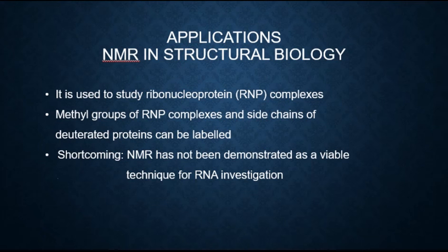The methyl groups of RNP complexes and the labeling of side chains of deuterated proteins have made NMR applicable to these RNPs. However, the use of NMR to investigate RNA, which is ribonucleic acids, is being further studied and developed as it will require even more advanced instrumentation.